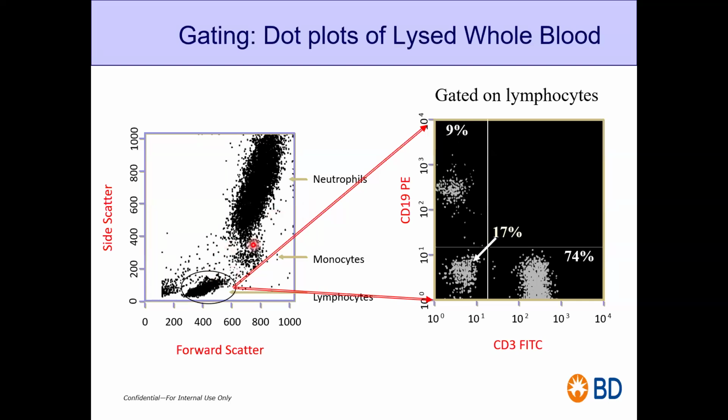So first we do the regioning. Regioning is like, let's say you have a home and you have made a boundary, right? So that is your property. Now it's up to you which things you allow to get in or get out. So regioning is like making a boundary around your population of interest. Okay, first you region that.